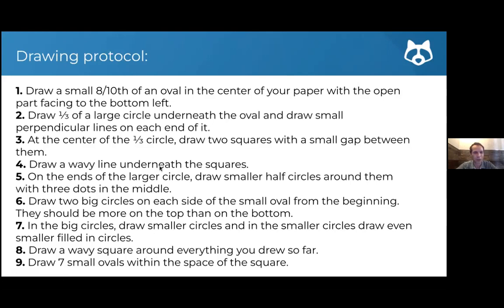And this is when we do in-person workshops, when we did them before the pandemic. This was one of my favorite parts of presenting. When we have a little bit more time, we also ask people to draw something and write instructions for it and exchange with someone else in the room to see how close they get to the original. In this case, obviously, we can't do that virtually, so it's a little bit more top-down, where we are asking you to follow our instructions.